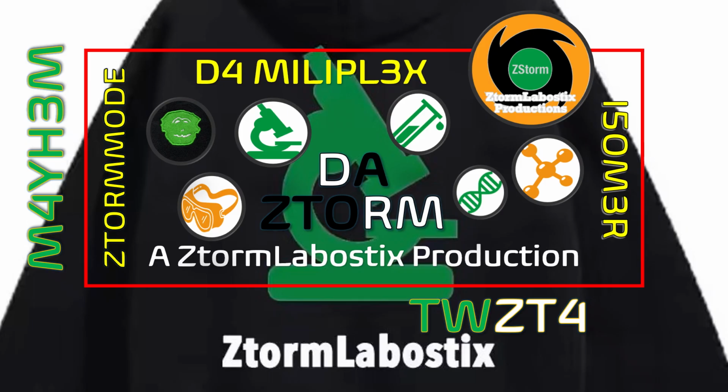Continuing on from the introduction, we now look at the function of nanopore sequencing technology, beginning with the principal elements.